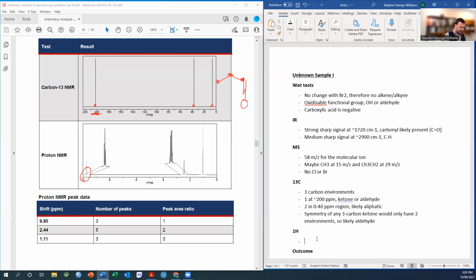I can also tell you from this fragment, okay, I know I have an aldehyde. One carbon away from that, I likely have something that is resulting in a triplet, which is the coupling that I can see there. And the most likely version of that is some sort of methylene, some sort of CH2. Again, this does look like what I've drawn earlier, but I want to keep that presumption away to say, well, that's the only way I can explain that signal. An aldehyde with two hydrogens next to it.